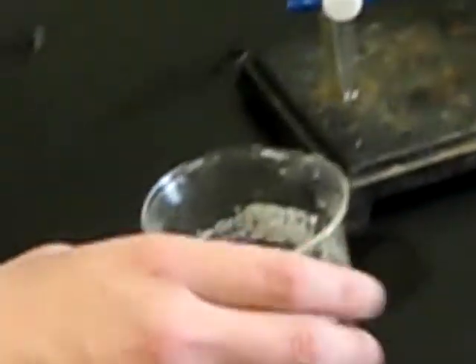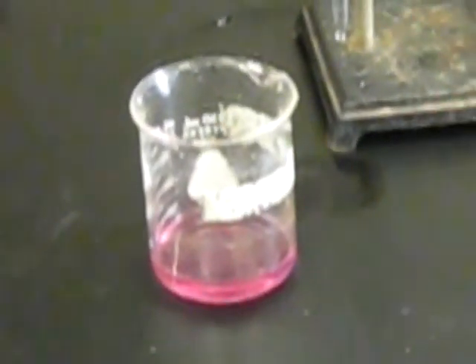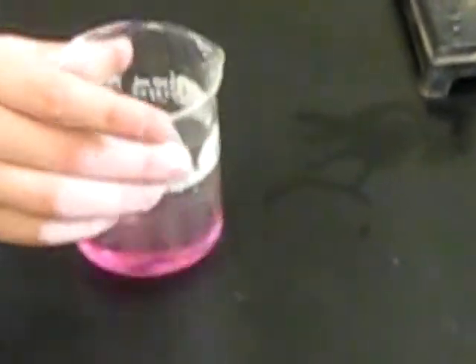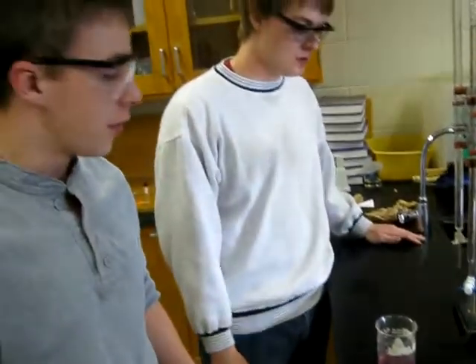So what we're going to do now is just stop adding the base and take our reading off of the burette. It's looking to be about 14.7 milliliters of the base. And what we do with that number is we take it back to our equation, molarity of acid times volume of acid equals molarity of base times the volume of base, and we can then solve for the molarity of acid.